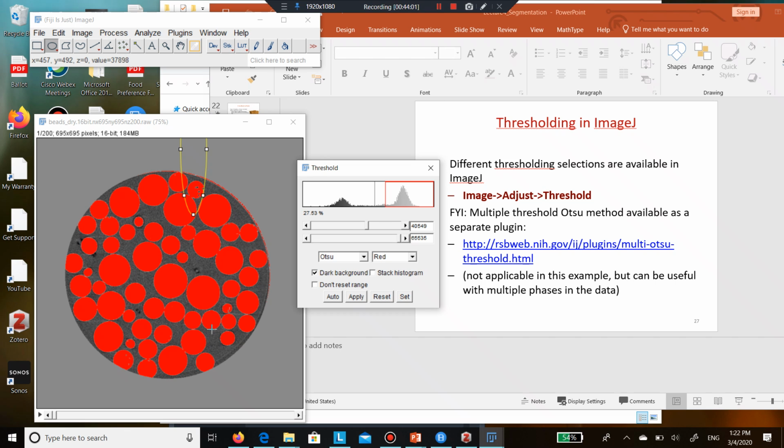Version of writing a letter. But if I have to somehow work with that boundary, find the surface area of that boundary, this is going to start bothering me. If I'm trying to send this to meshing for finite elements, good luck. You're not going to survive any kind of small features.